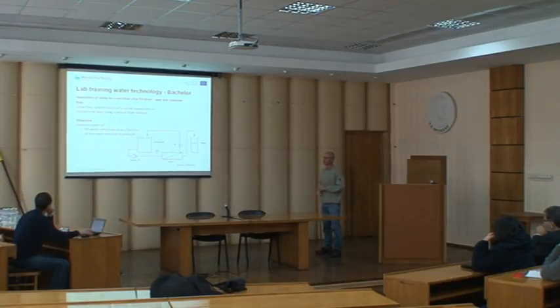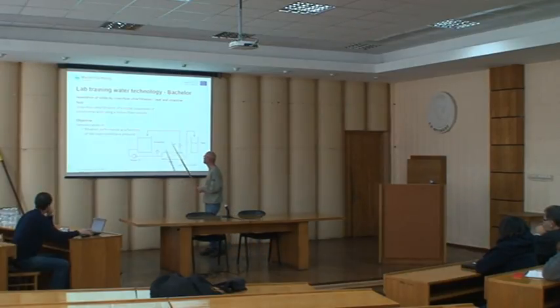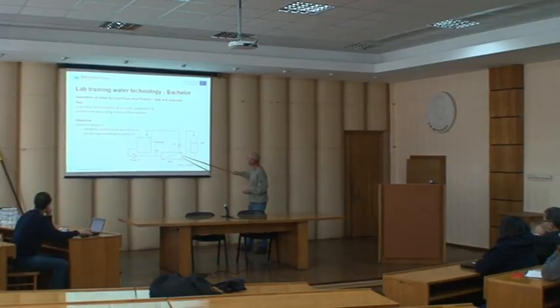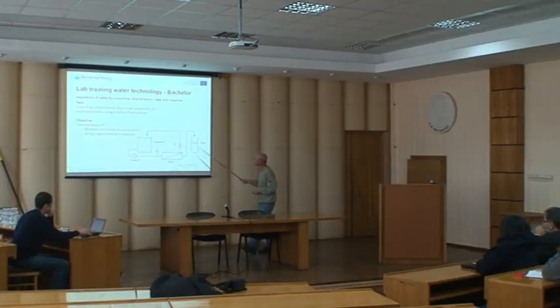This is a sketch of a cross-flow ultrafiltration system. So we have a small model system in the lab which has been charged. We get some filtrate out here, and we get an increase of the concentration in the circulating system. So we can show it on the next.